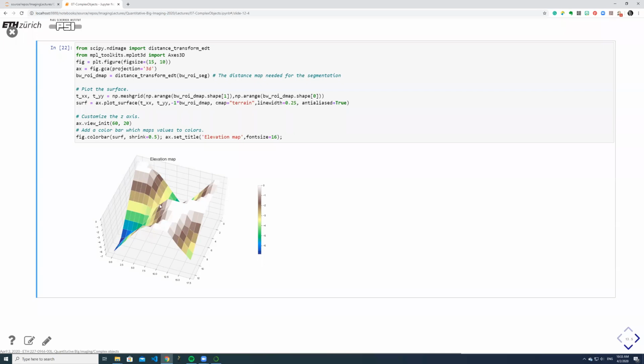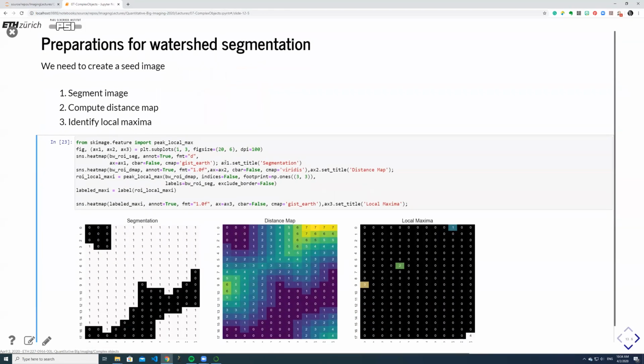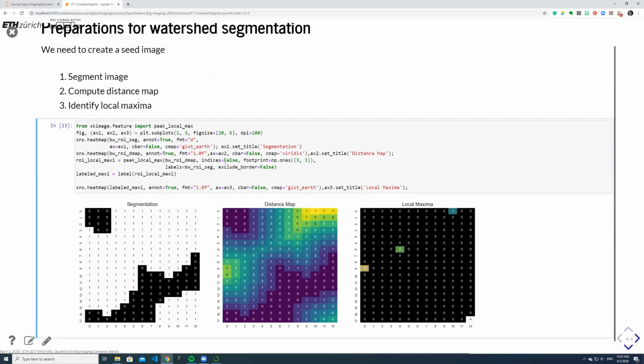And the algorithm is then building a dam between here and filling it up. And then you continue filling water until you only have filled regions and dam pixels between them. And the same, the water coming here is also filling up. And in the end, what we will get from this watershed segmentation is at least a little bit better segmented image.